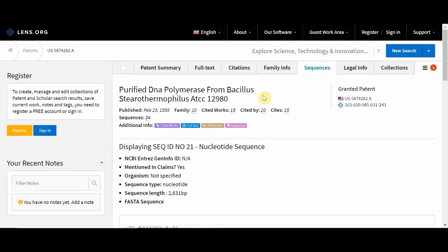So in order to optimize expression, we want to make sure that the use of codons is aligned to E. coli's general usage, and this is important to make sure that there's an appropriate pool of transfer RNAs for the correct codons to bring the amino acids during translation and hopefully to speed up expression.